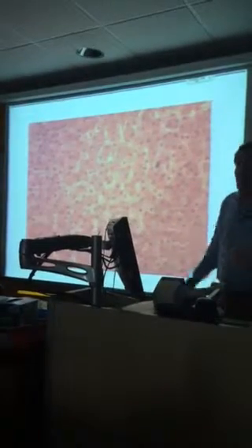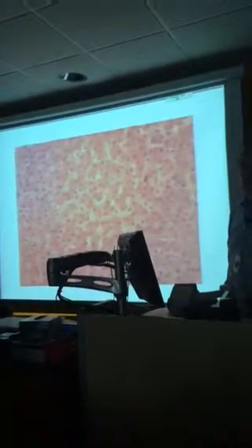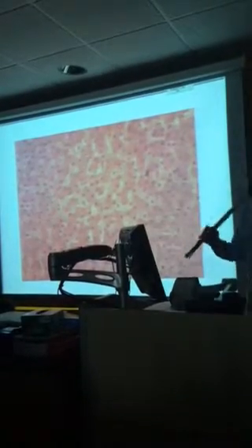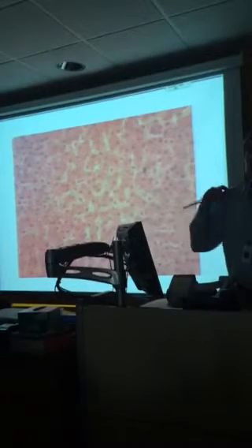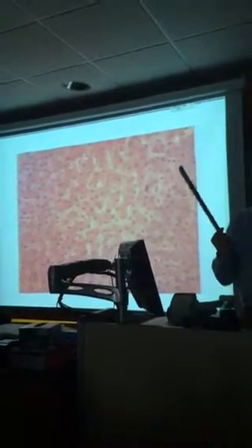But like the spleen, it's got this tortuous network of capillaries called sinusoids or sinusoidal capillaries. Remember the spleen I told you? You call them splenic sinuses. You call them sinusoidal capillaries, or sinuses. That's what these are, except they're called hepatic sinusoids. It's a very porous capillary. It's the one that has the big gaps in the wall, so big, in fact, that red blood cells can pass through. That's something you should know for the exam.